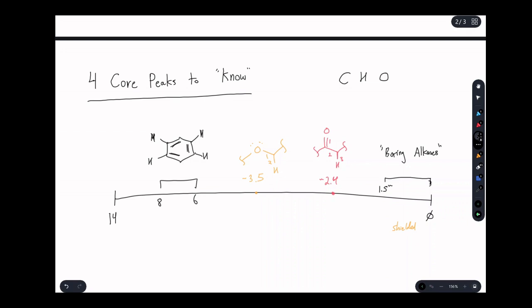One good tip that I'll help you with is only consider benzene when your molecule's chemical structure or chemical formula has at least 4 degrees of unsaturation or more. Right? Remember that benzene has 3 degrees of unsaturation in its double bonds and 1 degree of unsaturation in its ring. So if you see signals in this range of 6 to 8 ppm, and your molecule has 4 or more DOU, it's not a guarantee, but it's pretty close to that you have a benzene in your structure.